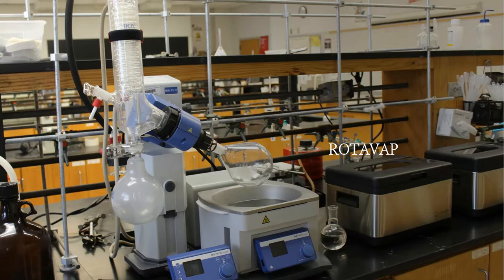So the RotoVap is a piece of equipment in our laboratory, and it's very much like a simple distillation. What happens is I've got a solution in this flask. This flask is lowered down to a hot water bath or a hot oil bath. You choose which one you want to use. And then that liquid will turn into a vapor. That vapor will travel over in this direction, and go up at a certain point. The reflux will cool that down, just like a normal reflux would. And I see some collection over here to the left-hand side.